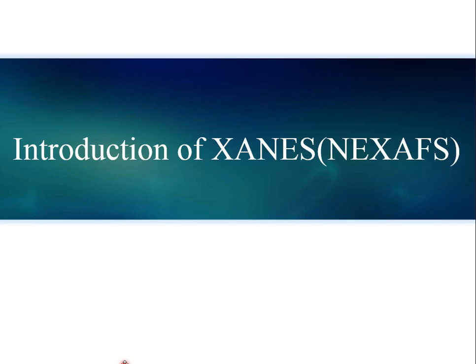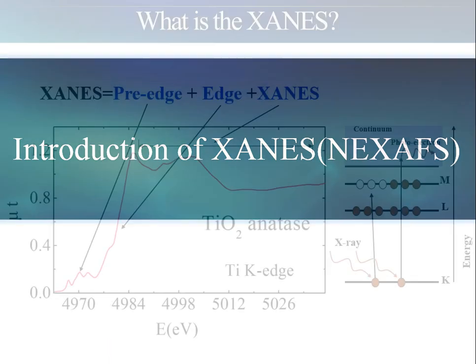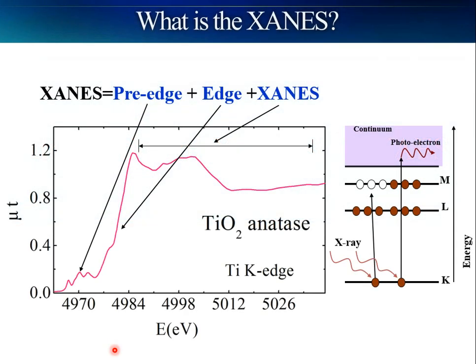Okay, let me introduce the XANES now. The XANES is composed of three parts: pre-edge, edge, and XANES. I already described those before, alright?